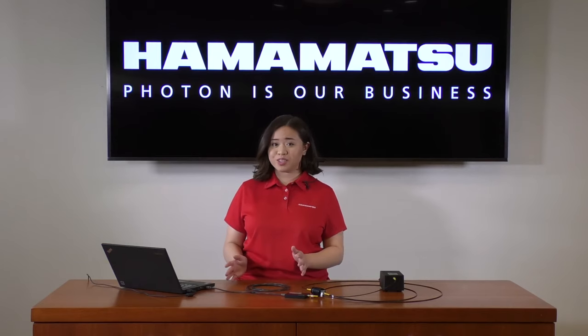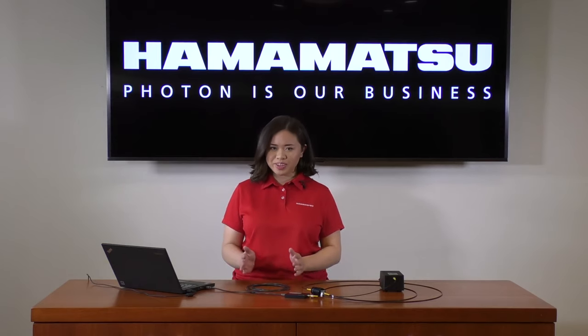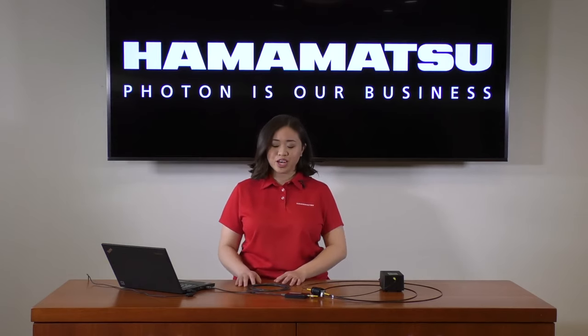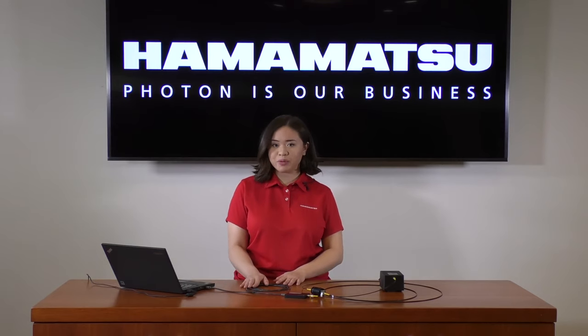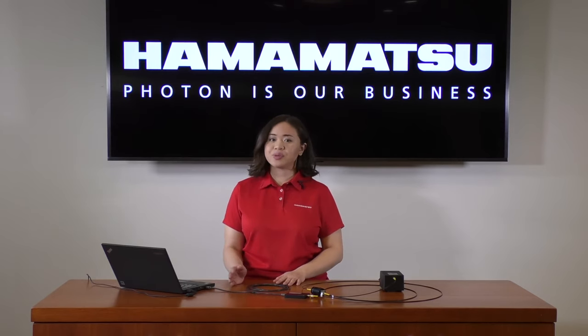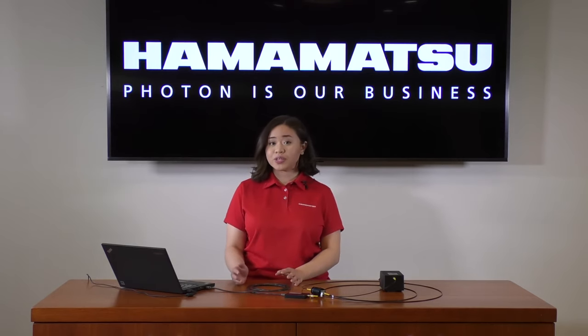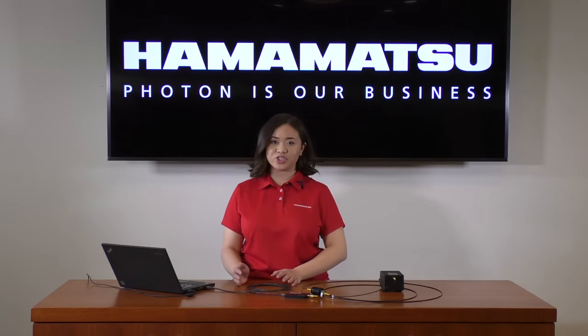When you first receive a spectrometer from Hamamatsu, depending on the model you receive, it can come with the corresponding USB cable, CD with evaluation software, hardware instruction manual, and software instruction manual.